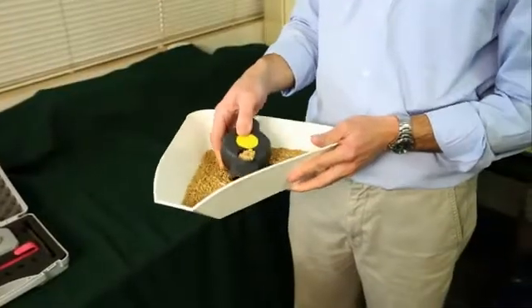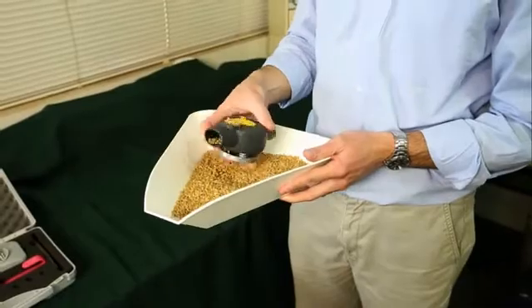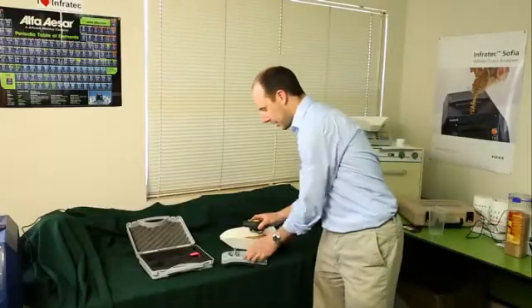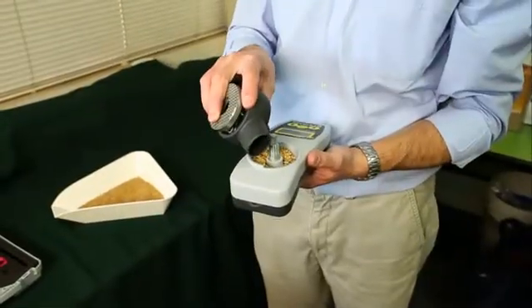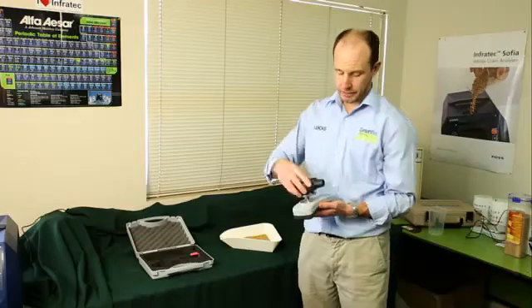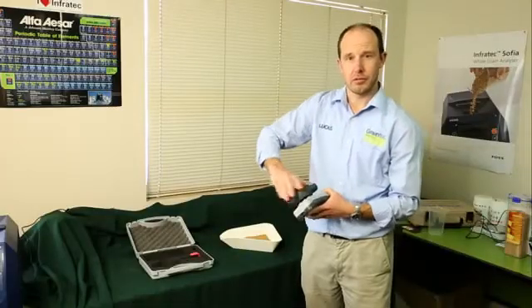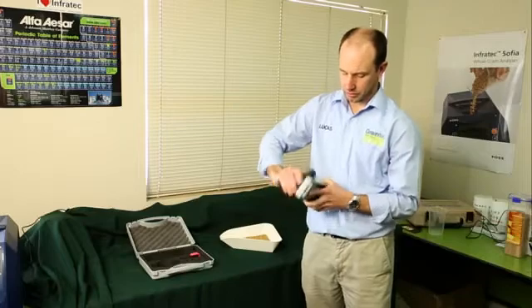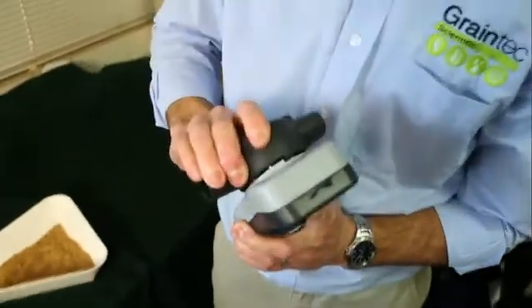Take a sample of grain with the integral tester, pour the grain in, just give it a shake to make sure that the grain is evenly distributed, and then screw on the top until it clicks.